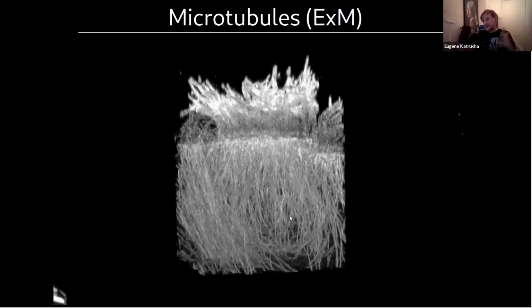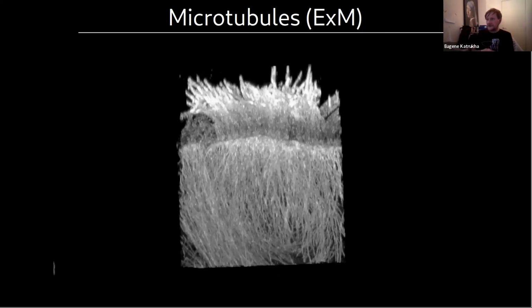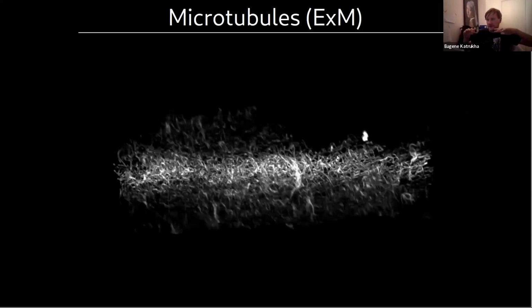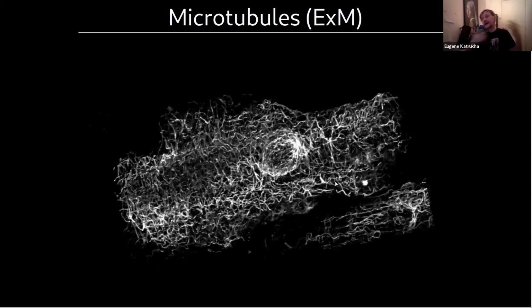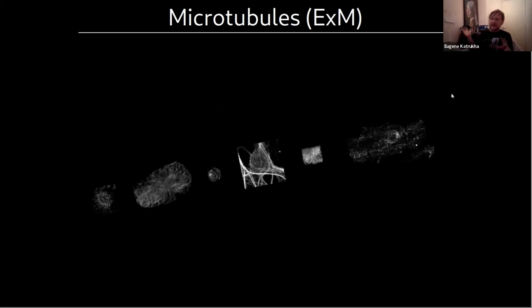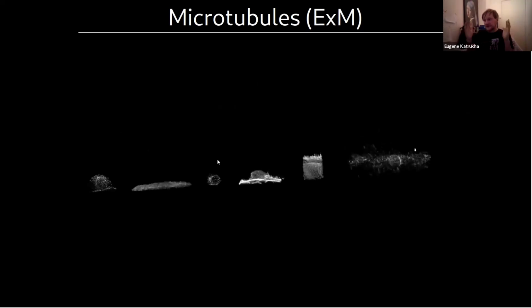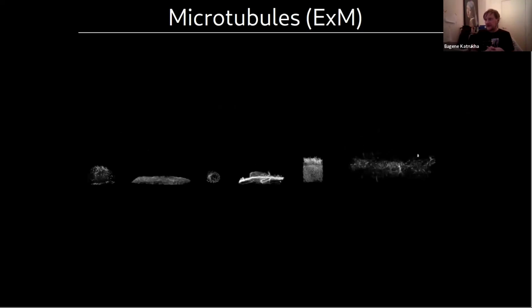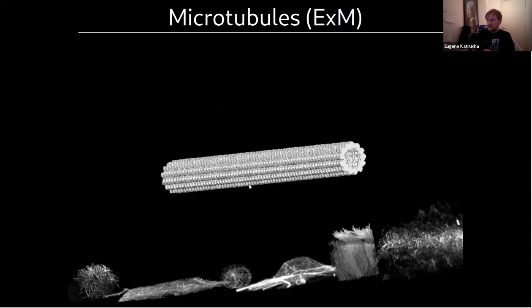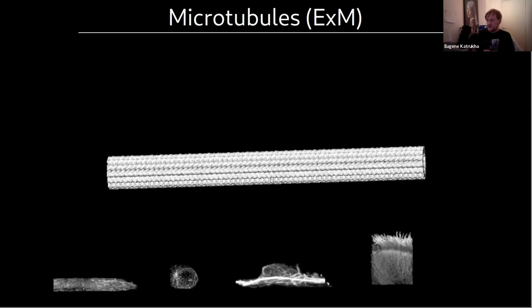And this is apical airway epithelium, and you see that the transport direction is ingrained from top to bottom, right? So this is where the filtering happens. And now we're looking at a cardiomyocyte, and here microtubules are all bent because, of course, it constantly contracts and bends. So as you can see, the microtubule network can take a variety of different beautiful shapes and structures.